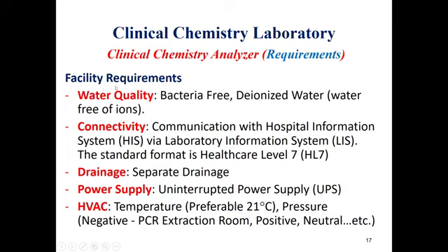Another point, each analyzer has a specific amount of water which needs to be provided. For example, in the case of the clinical chemistry analyzer provided by Beckman Coulter, the AU400, 20 liters per hour is needed for this analyzer to work properly.